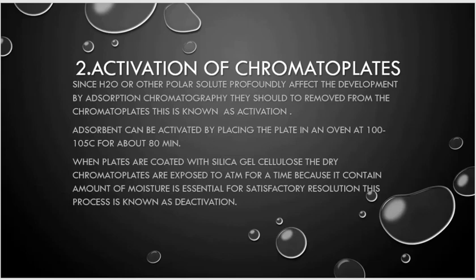When plates are coated with silica gel or cellulose, the dry chromatoplates are exposed to the atmosphere for a time, because a certain amount of moisture is essential for satisfactory separations, and this process is known as deactivation. Activation is when the water is removed, and deactivation is when it is kept in an open atmosphere.